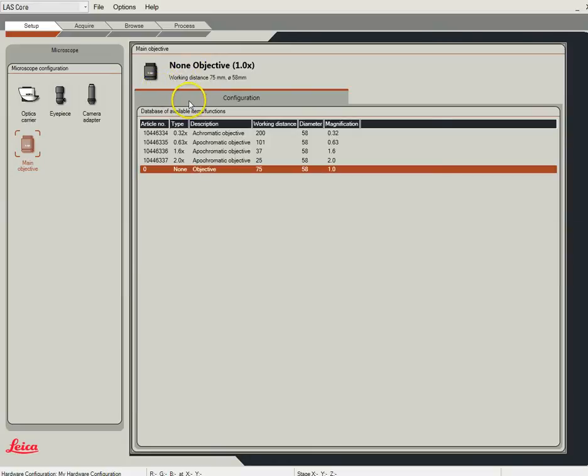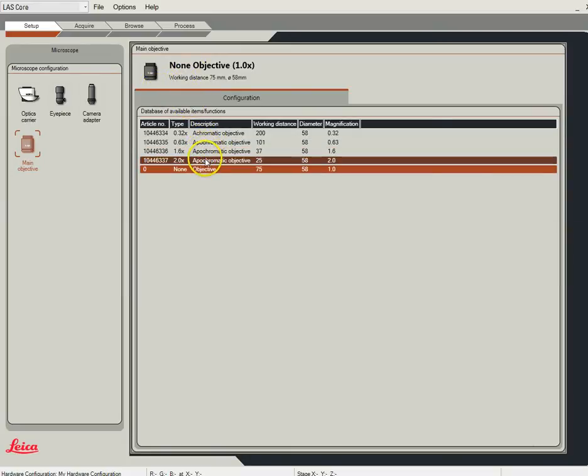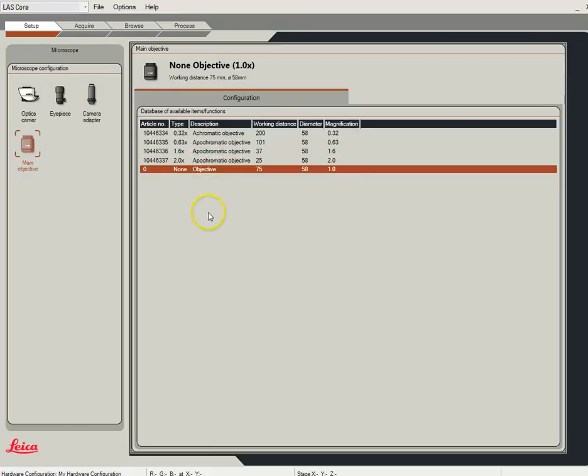Once we change objectives — either the .63, the 1.6, or 2.0 — then you'll have to come back in and manually tell the scope again that you've changed that.